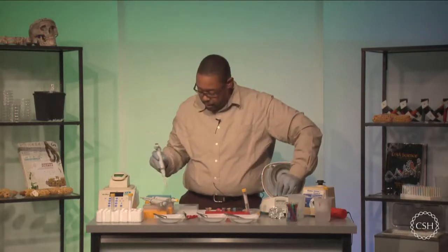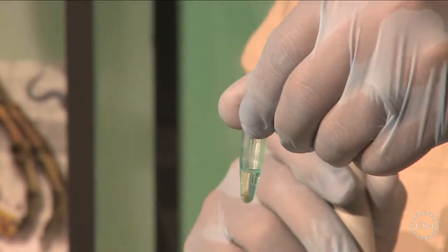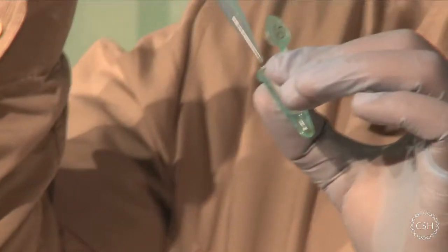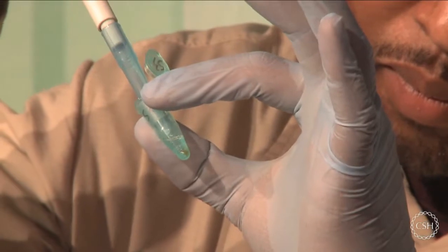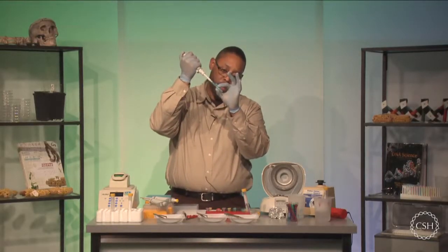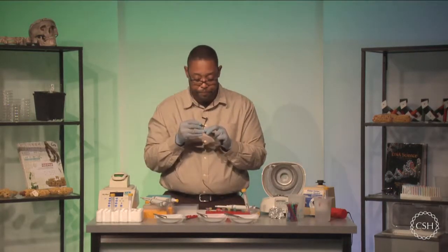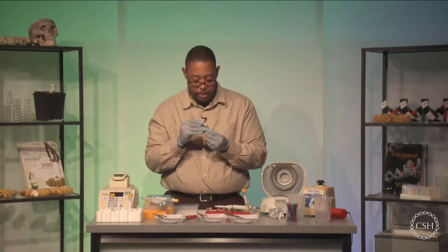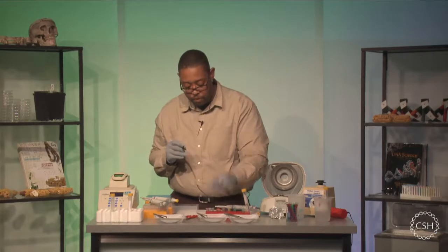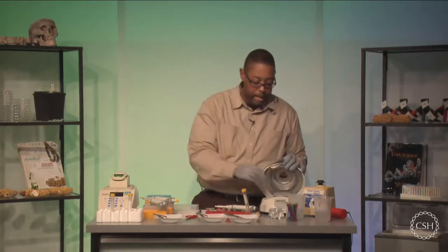Now, lastly, I'm going to go to my insect. As you can see, all the debris is at the bottom of the test tube, and I'm going to collect the clear lysate at the top. And this is going to be my sample number three. And this is my insect. All right, so I have my three test tubes that have the essential supernatant that I need, and it has my DNA inside of there.